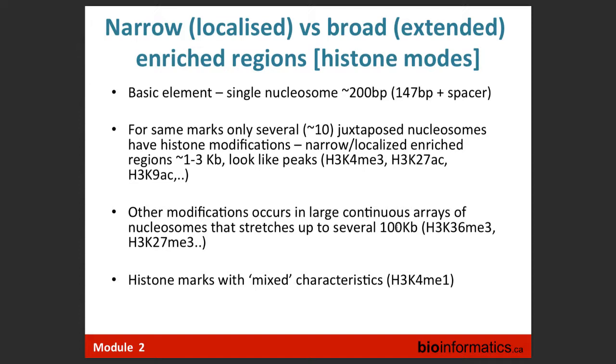However, you can't do this directly. You can't infer flanks by eye. We can determine where is flank and where is peak, and we have to teach our algorithm to do this. And we have to do this within the IP itself, because the level in input can be completely different from the level in our IP. So it's more that you calculate in your sample, okay, it's a 40% increase over this other region, and then you go into input and say here I only have a 2% increase. Something like that. It's very logical.